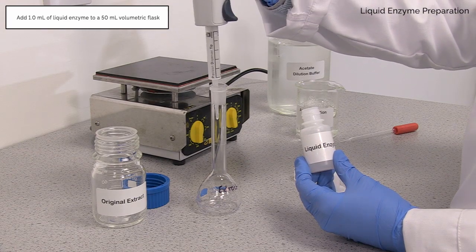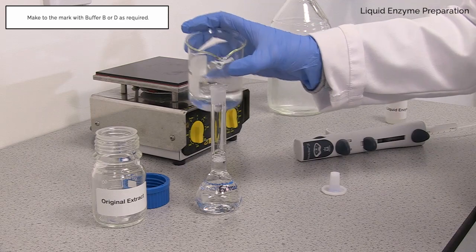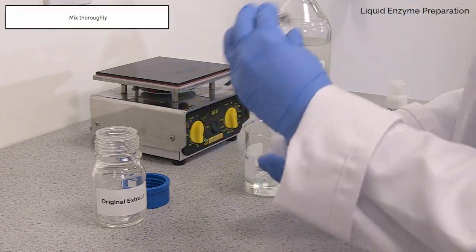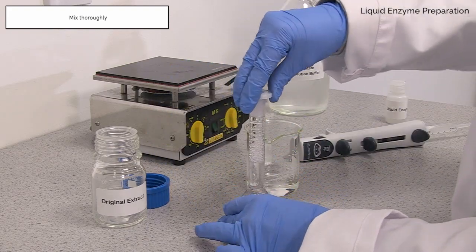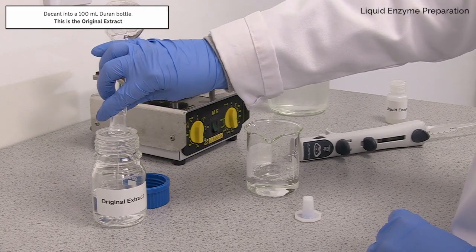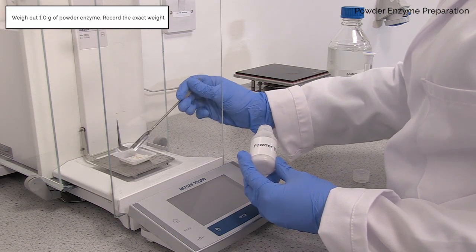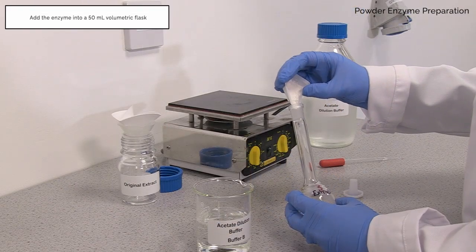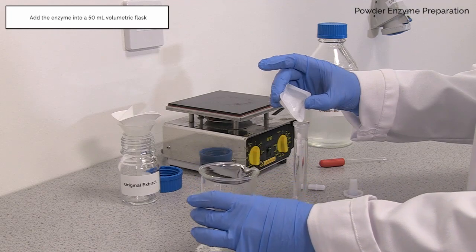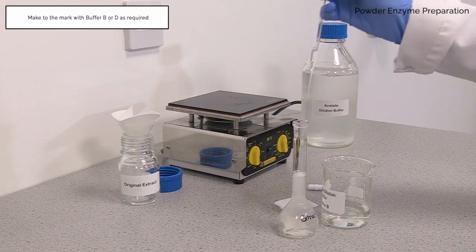In this video we demonstrate how to prepare both liquid and powder enzyme extracts. Add 1 ml of liquid enzyme preparation to a 50 ml volumetric flask and make up to the mark with dilution or extraction buffer, either buffer B or D as required. This is the original extract. For powder samples, record the exact weight and add to a 50 ml volumetric flask. Wash the weigh boat and make up to the mark with dilution or extraction buffer, either buffer B or D as required.